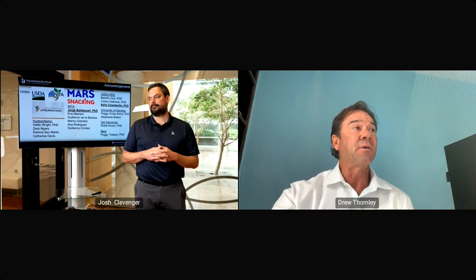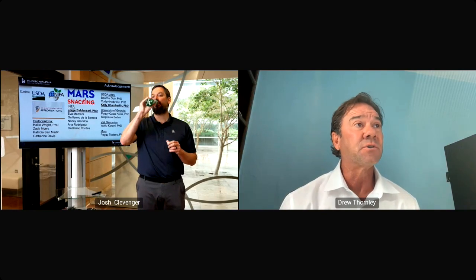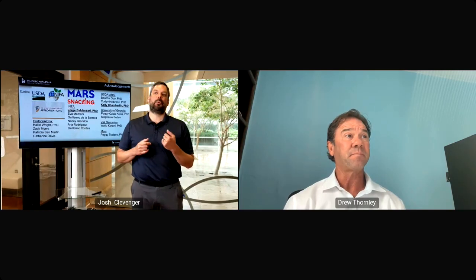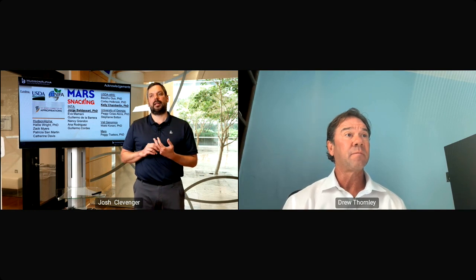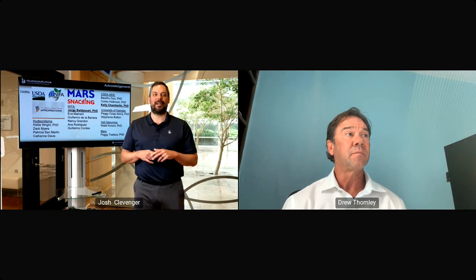Wonderful presentation. This is a multi-question kind of question here that was typed in. Again, wonderful presentation. What marker-based system have you used to screen the mapping population once after your computational discoveries? Yeah, great question. At this point in time, we mostly just use skim-seq on everything because we've got it to the point that in my hands it's a certain cost, which is extremely low, which I won't share, but it's effective for us just to do that.